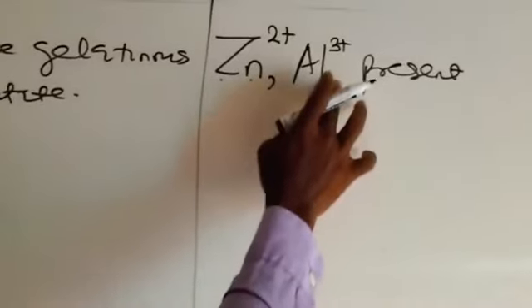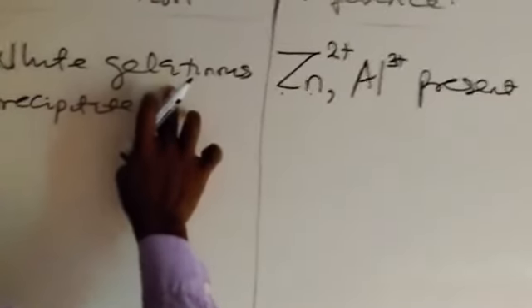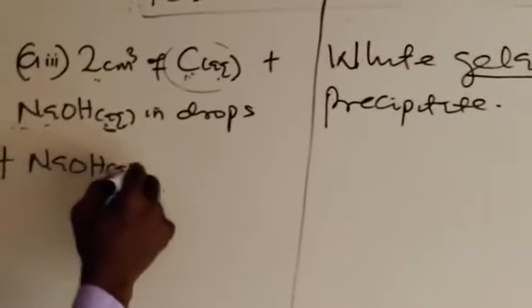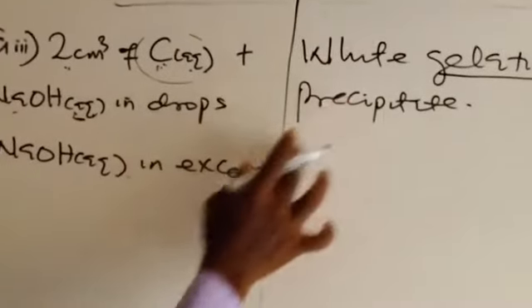You don't put lead because it's gelatinous. Lead is pure white or chalky white. So because of the word gelatinous, you remove lead. The next thing you're asked to do is to add the chemical again, sodium hydroxide, to this precipitate in excess. To the PPT form, we're adding it in excess to it and see what's going to happen.